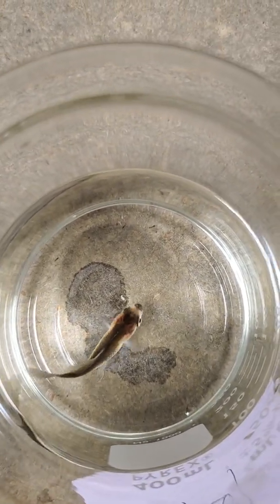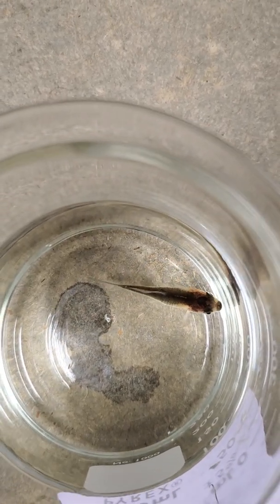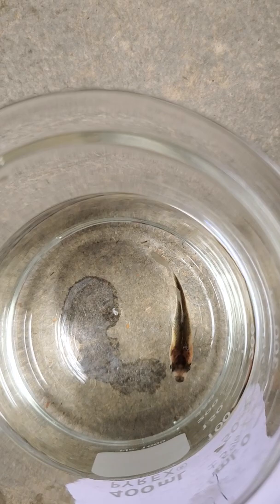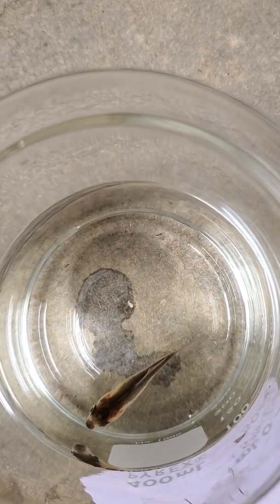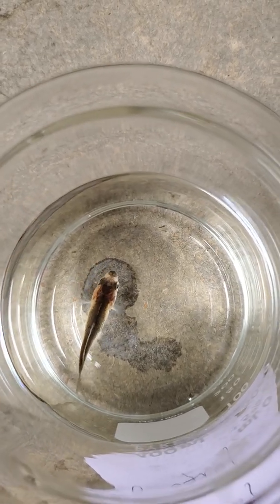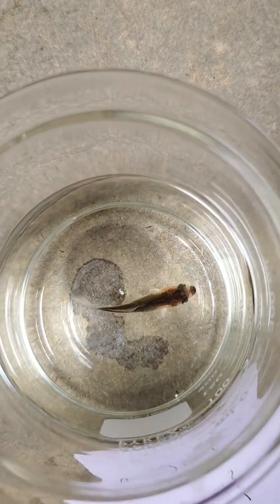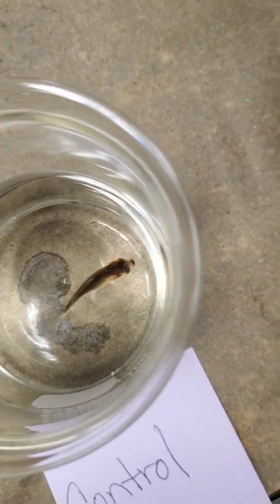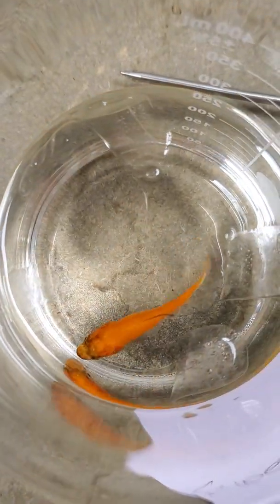Make sure you're filling out your document online as well. And then at the end, it asks you to create a graph, and we will go through how to do that in a different video. And time. And now for our last experimental, 9.4 degrees Celsius. And start.